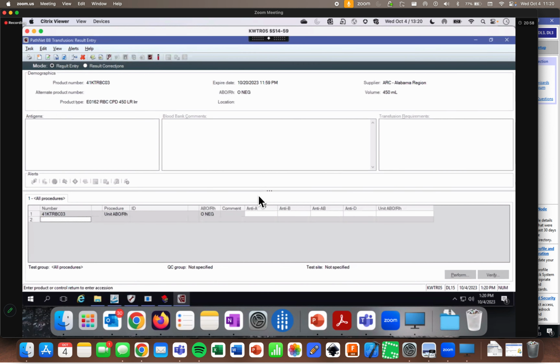All right, so pretty classic blood bank tests. You've got component procedures, right? And this one I've got anti-A, anti-B, anti-A,B, and anti-D. So if I put in my results, and then I go over to my unit column, so this would be my interpretation, it auto-generates the answer, right? So that just pops right up. That is the system-generated interpretation.